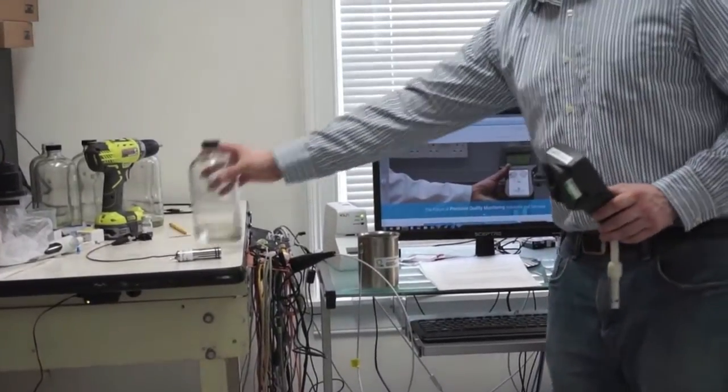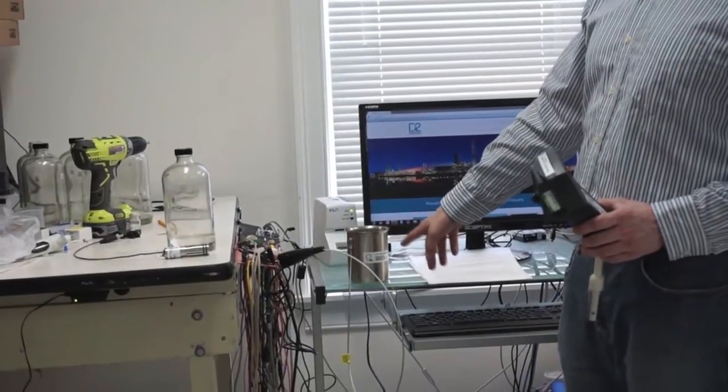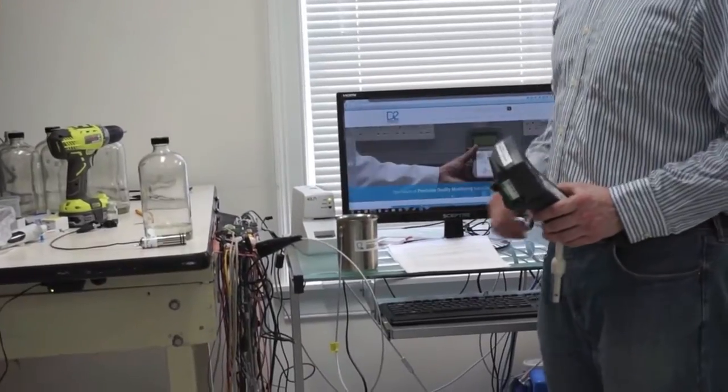We've taken a sample of jet fuel and put it in the JF1A HH-BK beaker, which holds the jet fuel sample and is grounded as you can see here.